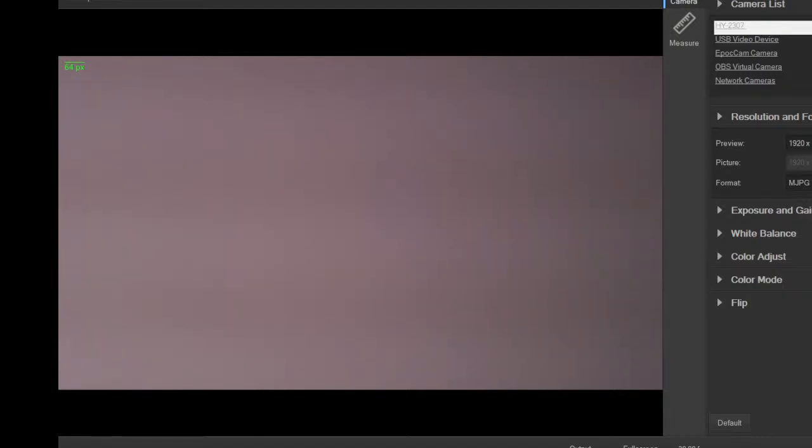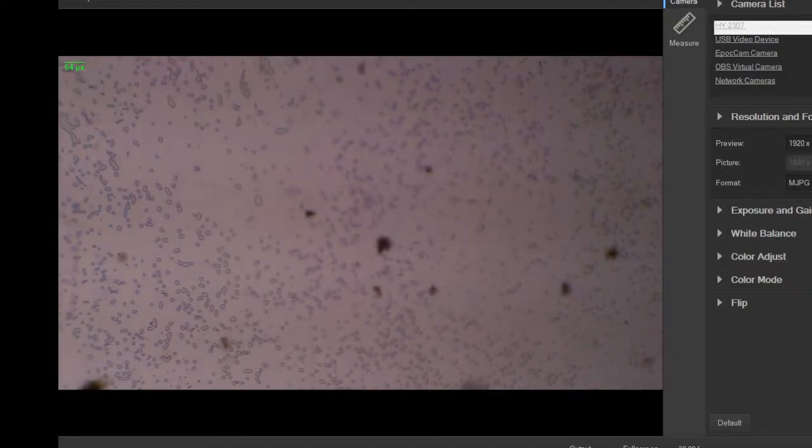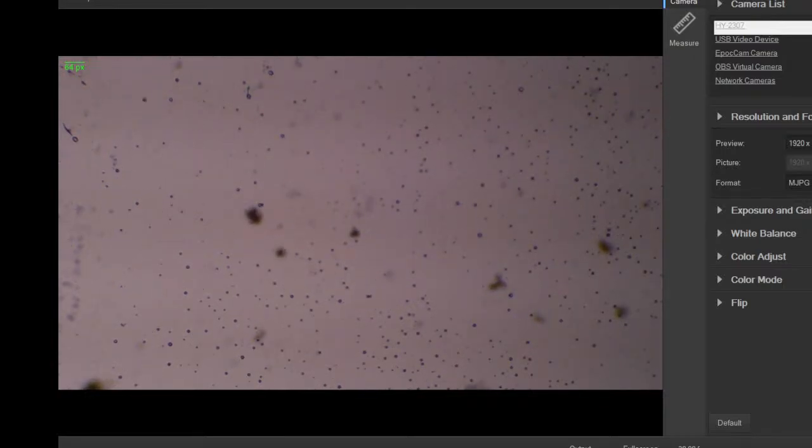Let's shake this guy up a little bit. Let's see, got some leaves in here. Something will shake loose, I hope. A little bit of tint to the water, so there was some kind of very thin mud mixed in with the water. So hopefully something was caught in there too. Never know. All kinds of things moving, but only from diffusion.